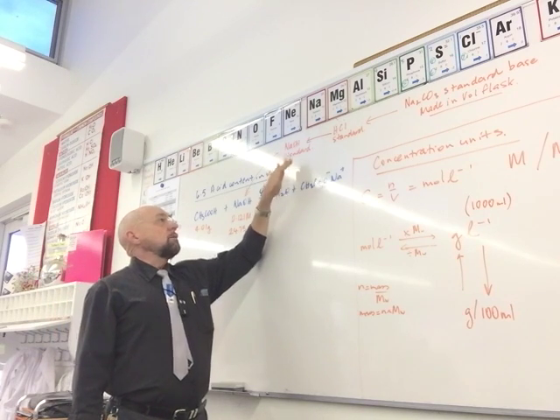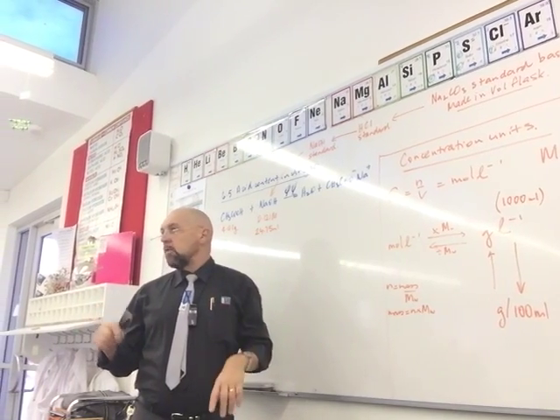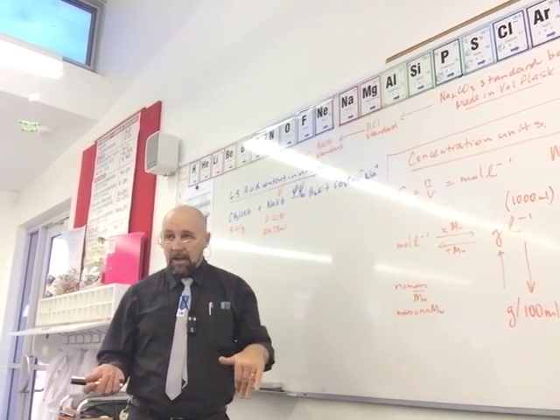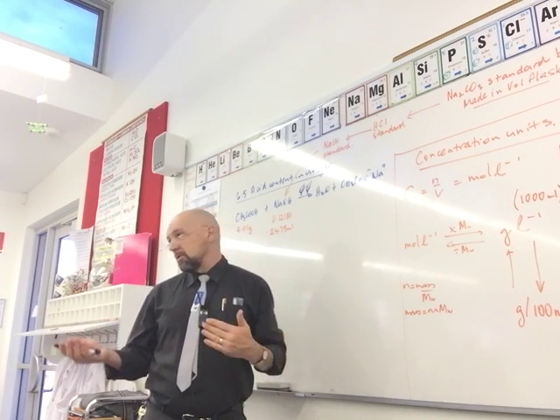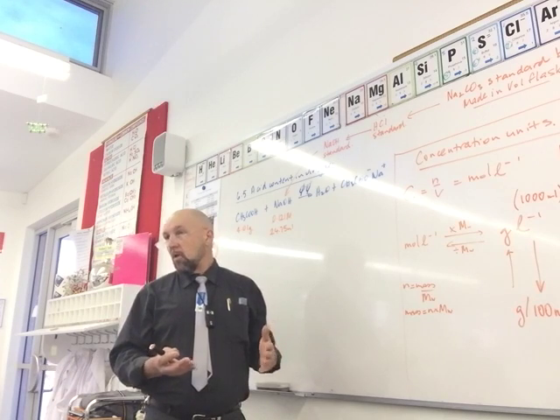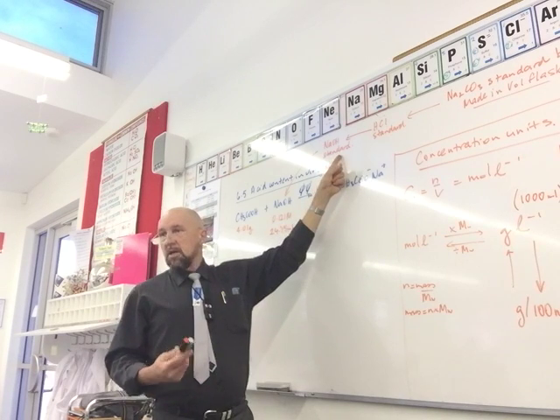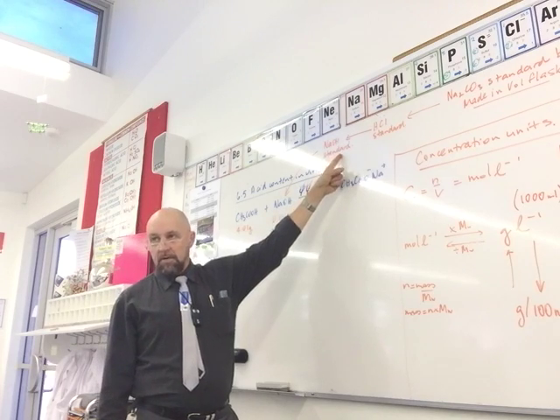So this is a chemical that we're not sure about how pure it is, because from day one it absorbs moisture. So if I weigh out 5 grams of sodium hydroxide, and if I were to put it into a volumetric flask, well, 4.8 grams of that might be sodium hydroxide, 0.2 could be water. We don't know. So we make the solution, or we get a solution that's made for us, and we have to standardise the sodium hydroxide. It's the first step of every experiment that we're going to do, wherever we're using sodium hydroxide.